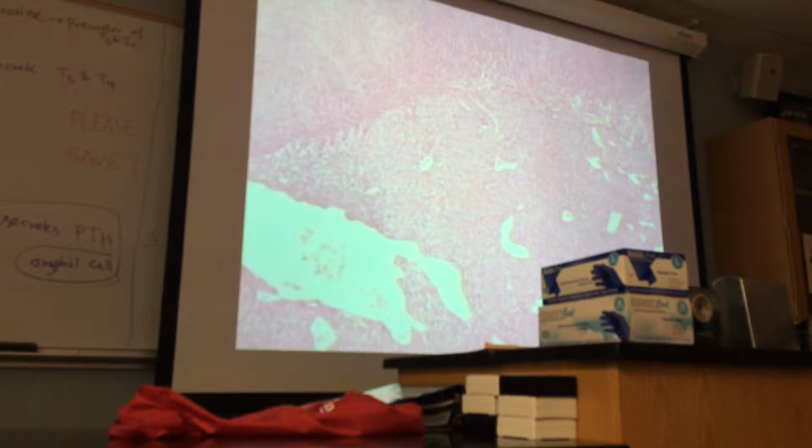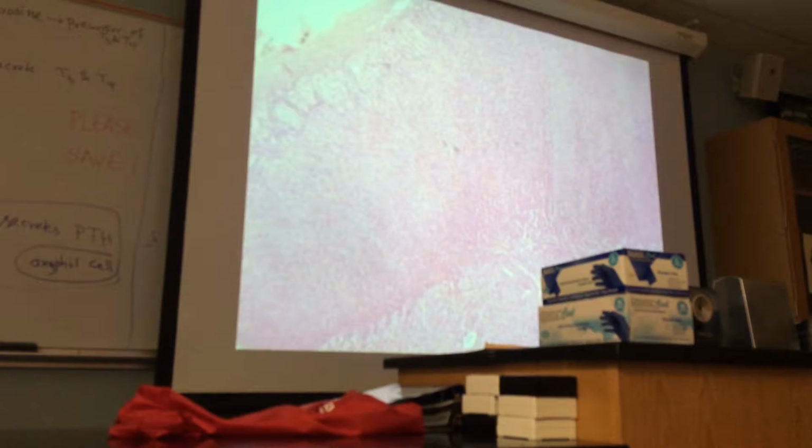About 20% adrenal medulla and 80% adrenal cortex. You can make a note of that. Adrenal cortex 80%, adrenal medulla 20%. Let us look at the whole adrenal gland, and you can see adrenal cortex from here to here, and this is adrenal medulla.